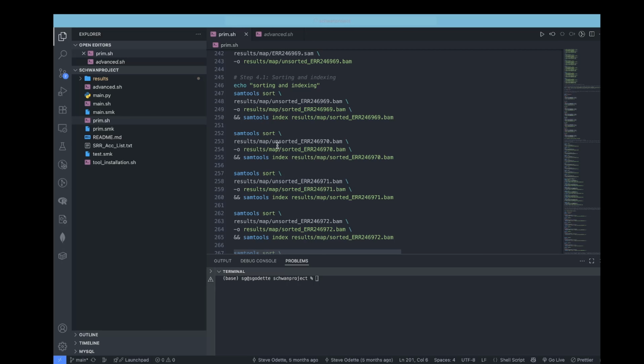And by doing so, we will basically organize the reads in terms of their genomic coordinates. This basically means that we will have reads that map to the beginning of a chromosome appearing first, followed by the reads that map to subsequent positions along the chromosome.